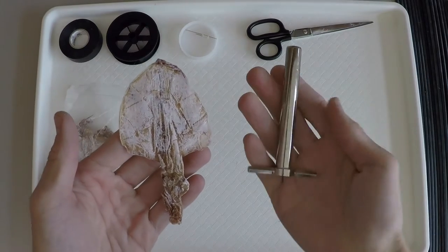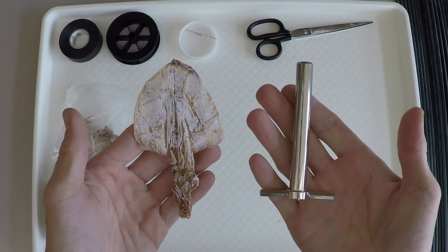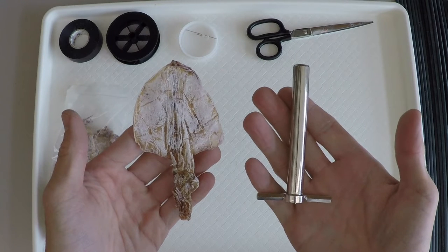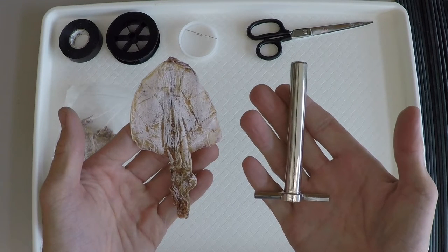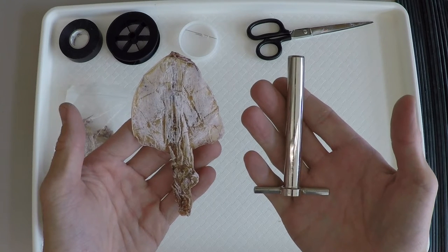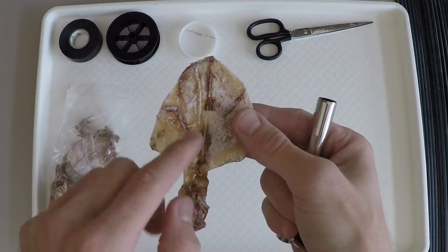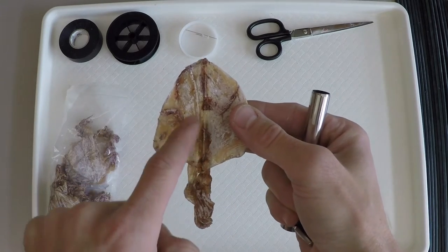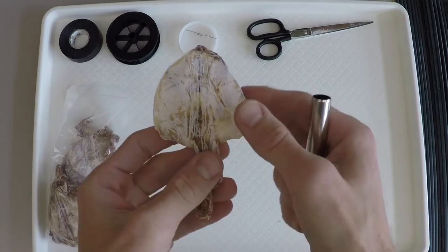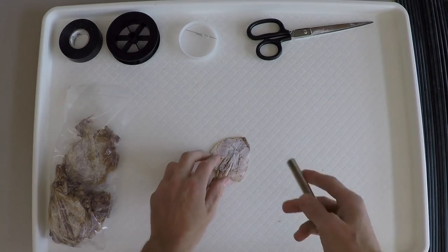Begin by cutting out 25 circles of squid mantle with your cork punch. If you are unable to find a 1.3 centimeter diameter cork punch, you can also cut the mantle into 1 by 1 centimeter squares. Just be sure to note that you cut them into squares when you record your data. Try to avoid the center line of the mantle, as this is where the squid's pen is located. Punching through the pen tends to result in thicker pieces of squid that separate easily.